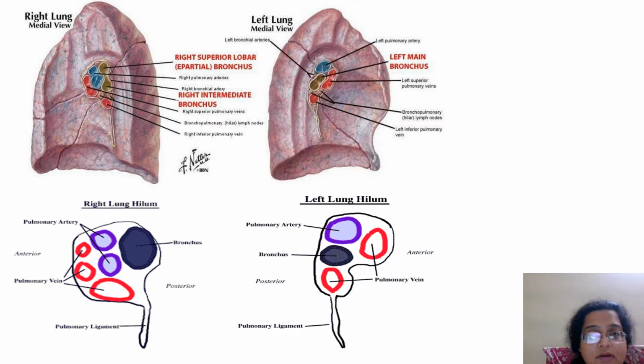and then I am mistaken, sorry, then you're going to see the artery. Why has it been colored blue if it is the artery? Now you are going to read it, and this was given in your anatomy classes. Why is the artery labeled blue in lung? There's a pulmonary artery and then there's a bronchial artery. What does the pulmonary vein carry and what does the pulmonary artery carry?